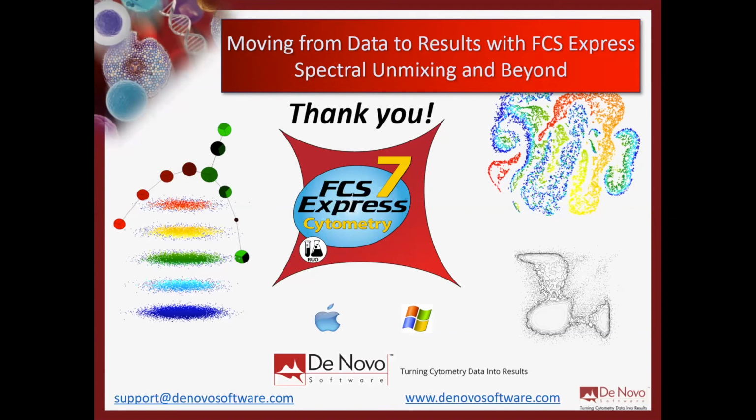Yeah, so everybody's algorithms are a little different. This kind of stuff is generally proprietary. We're using the standard ordinary least squares method right now. As Jeff mentioned earlier, Sony's using a weighted least squares. And again, what you're going to see in the not so distant future is FCS Express is going to offer a number of different algorithms. Right now you can pull in your data that's been unmixed in other software, redo the unmixing in FCS Express, and compare side by side if you'd like. And in the not so distant future, you can use any of the algorithms that we use to make those comparisons as well.